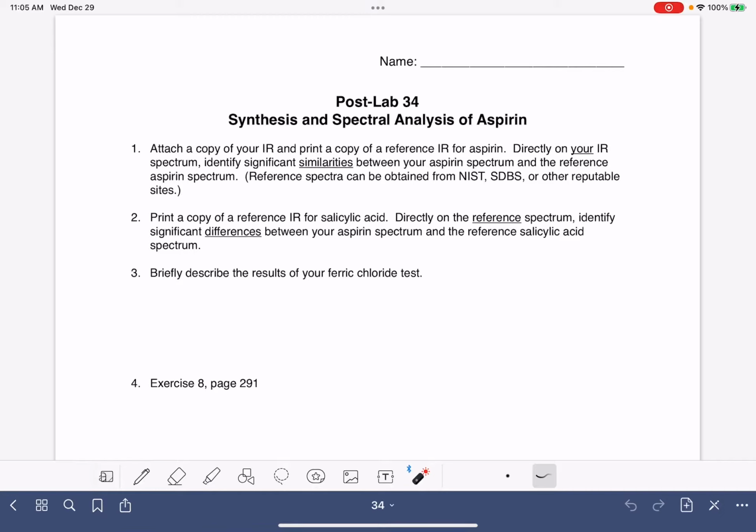In this video, I'm going to walk you through post-lab 34, spectral synthesis and spectral analysis of aspirin. Questions number 1 and 2 have to do with IR analysis. For question number 1, I want you to attach your IR and a reference IR for aspirin. Your reference IR can come from NIST or SDBS or any other site that is reputable. And on your IR spectrum, I want you to identify significant similarities between these two spectra.